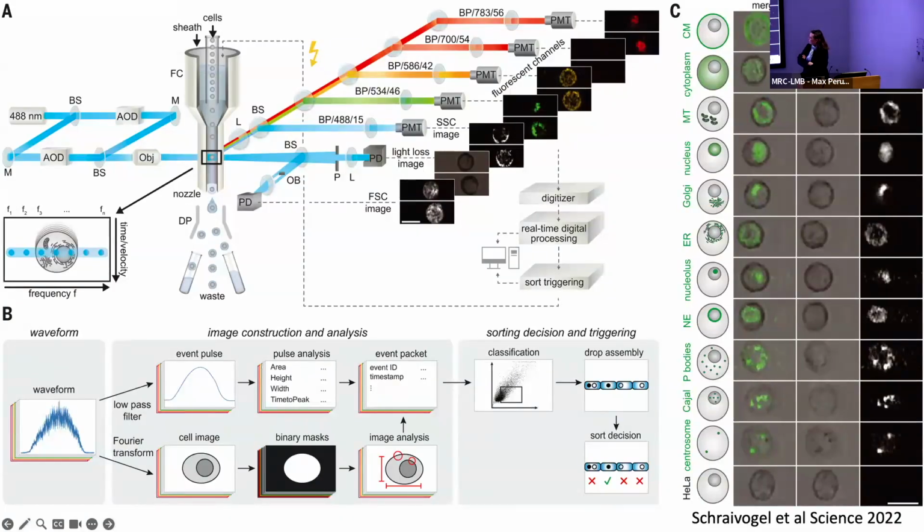Because we can now, not only are we just looking at mean fluorescence intensity, but we're able to actually localize where that intensity and where that fluorescence is coming from. So it's really quite an amazing development. And I anticipate, not just me, but the community anticipates that this will only move forward into greater resolution and abilities to fractionate out cells with more accuracy.